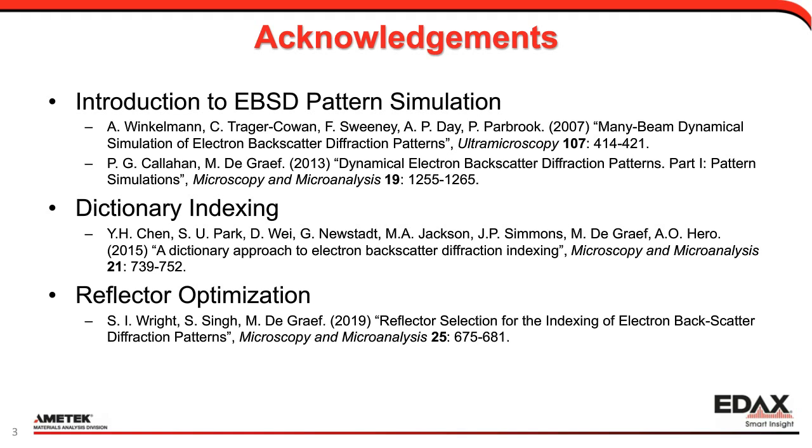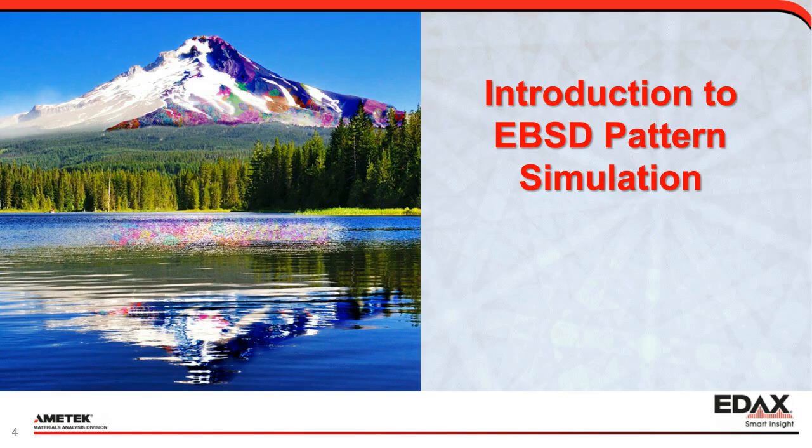In terms of the dictionary indexing, which we'll be talking about, once again, that comes out of Marc De Graef's group with quite a few other folks working on a dictionary approach, and I'll explain what I mean by dictionary indexing later. And then Reflector Optimization, once again, is work with Marc's group and Singh that I did really just early or at the end of last year. We'll talk more about those. I just want to make sure that those folks get credit for the great work they've done. So let's go ahead and get started with an introduction to pattern simulation.